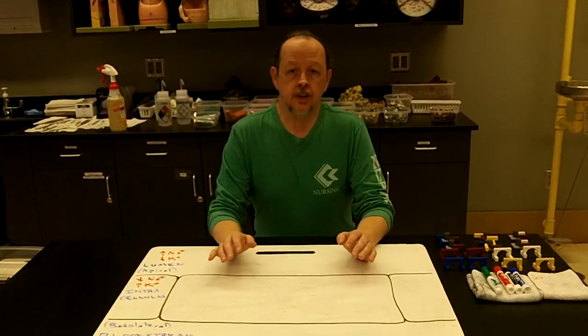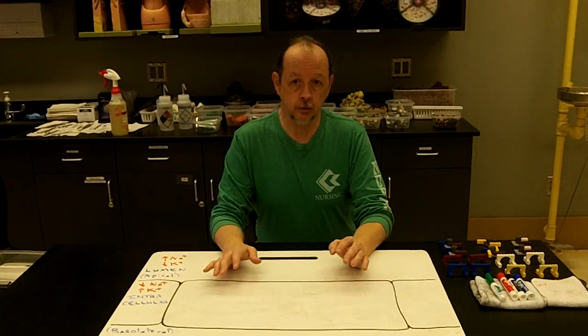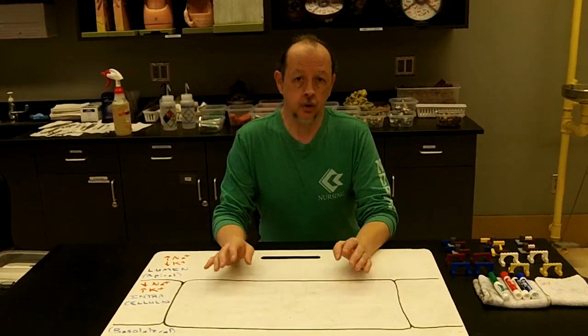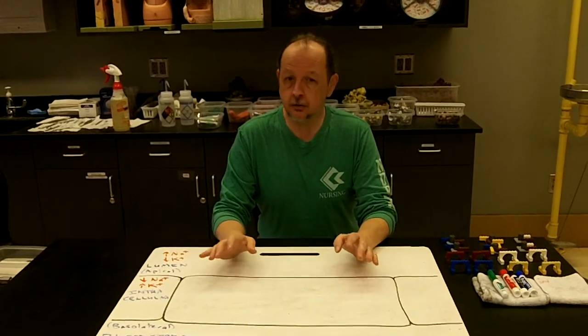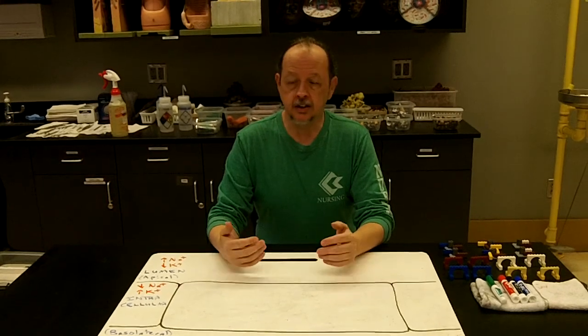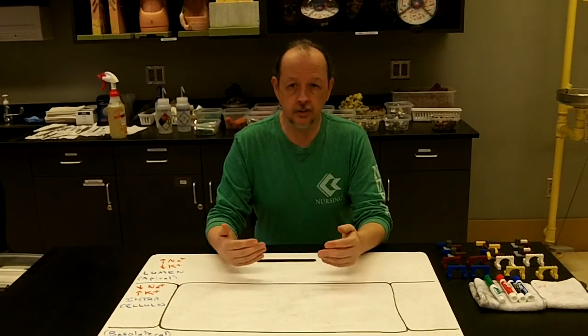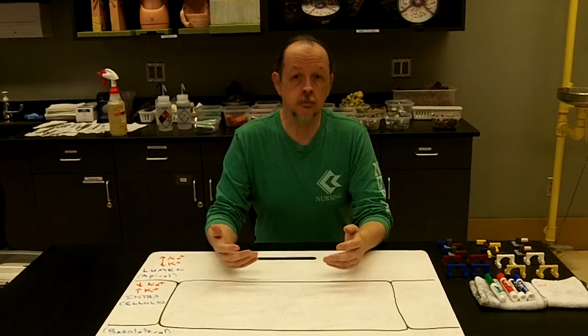This video is going to demonstrate how to do a hands-on activity for membrane transport. Membrane transport is one of the core concepts in anatomy and physiology. If students can really master the concept of movement of ions across a membrane, then tissues like muscular, nervous, digestive, urinary can be so much more understandable. It goes beyond just memorization.